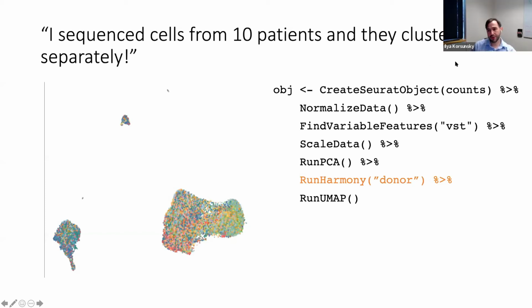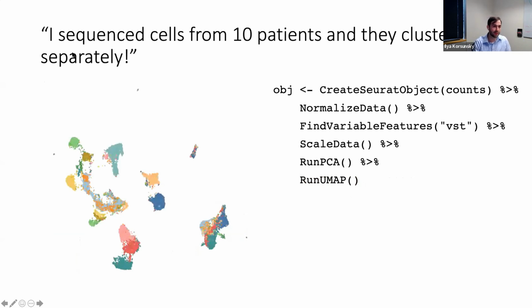Yeah, I mean, usually we don't have cluster assignments before we do batch effect correction. We'll do this kind of plot where we'll see this, right? So here, I know which cell types they are because I've seen this plot a million times, but at this point in the analysis, we don't know what the clusters are, right? Yes. And so this is before clustering.